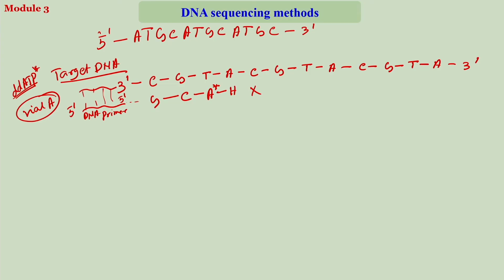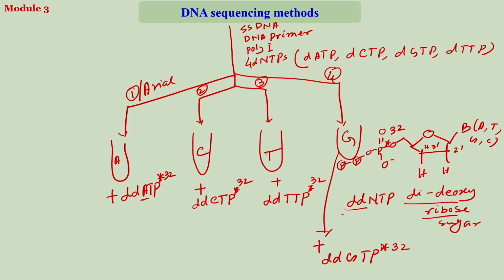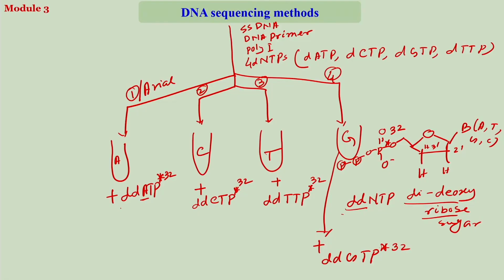Okay. So, what Sanger has done, in each of these vials that you have added the ddNTPs, the quantity of the ddATPs or ddCTPs, ddNTPs was small compared to the normal dATPs or the normal dNTPs. The idea is you allow the extension to happen, but at the same time it can stop a certain fraction of the reactions due to presence of these molecules.